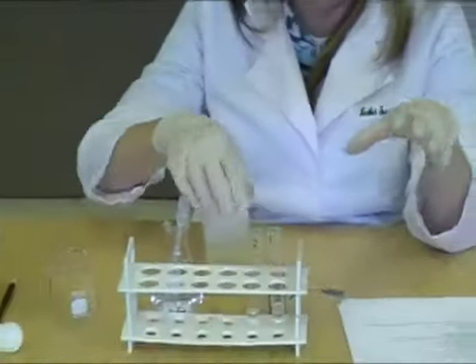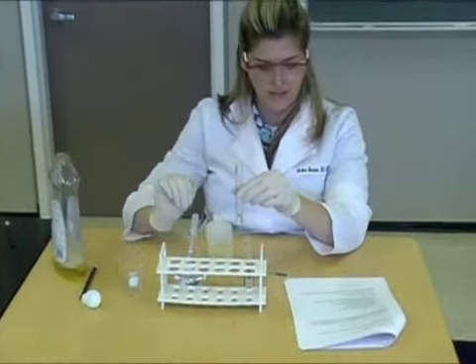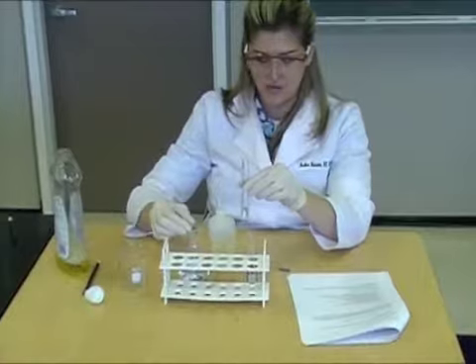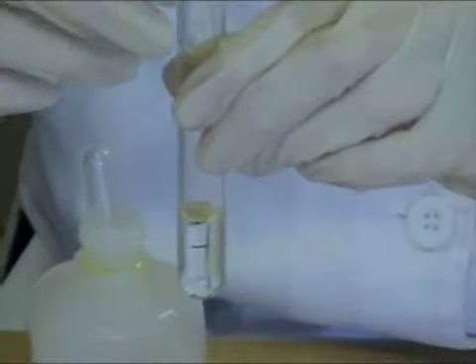In test tube 2, add distilled water to the 1 cm line. Then add your glucose solution to the 2 cm line. Swirl or tap and observe your results.